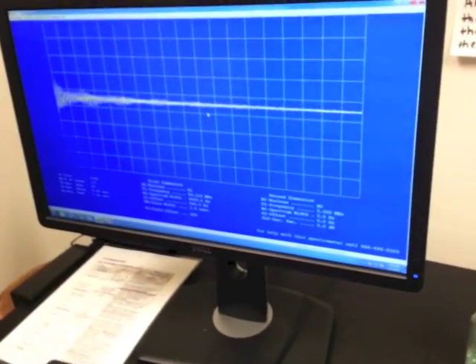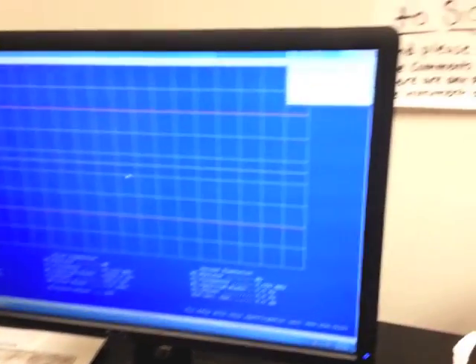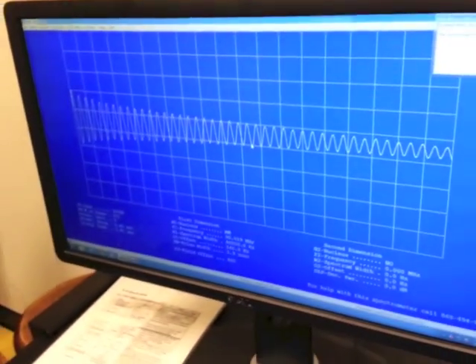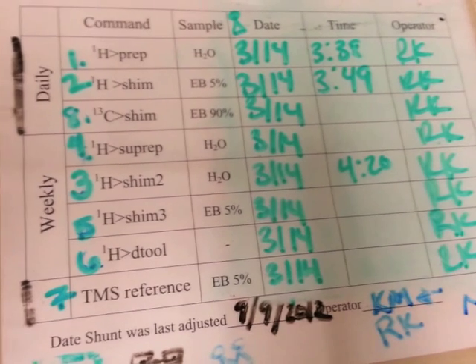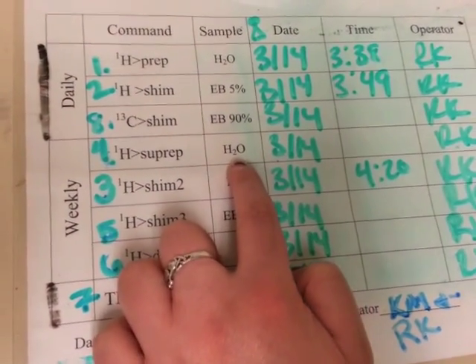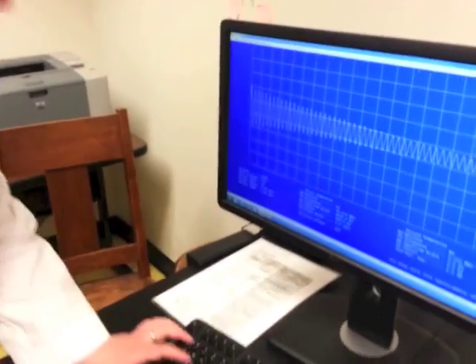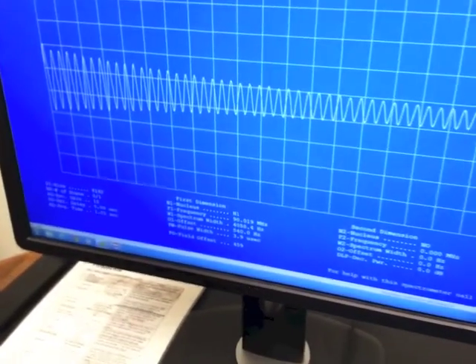Come back over to the computer and type in SHIM2. Once SHIM2 is done, SUPREP is the next step. We need the water sample again so we don't have to change anything out — just go right over to the computer and type in SUPREP, hit enter.